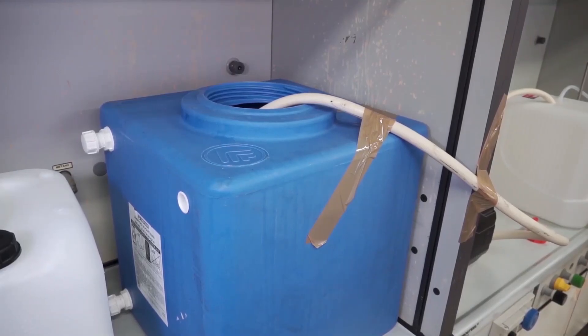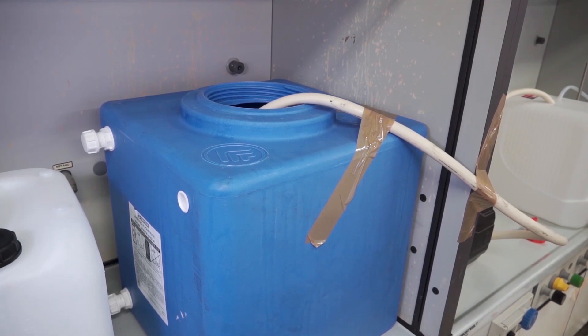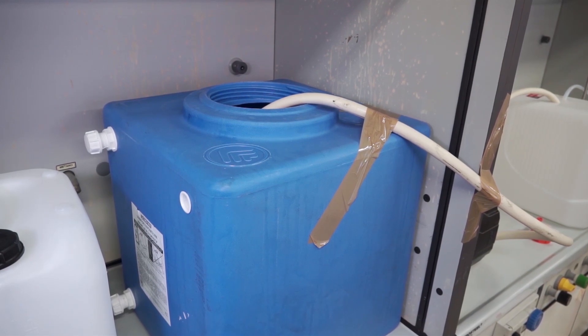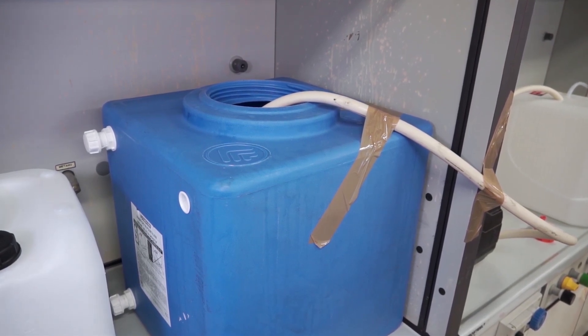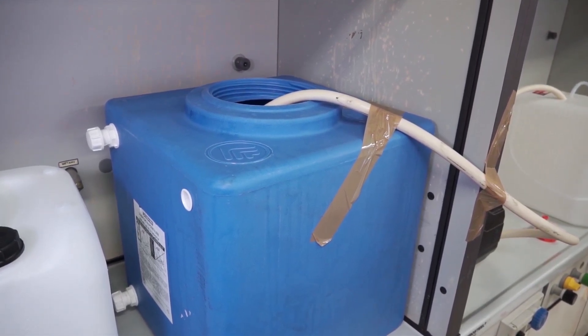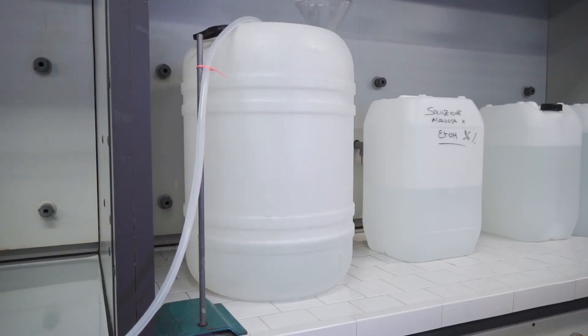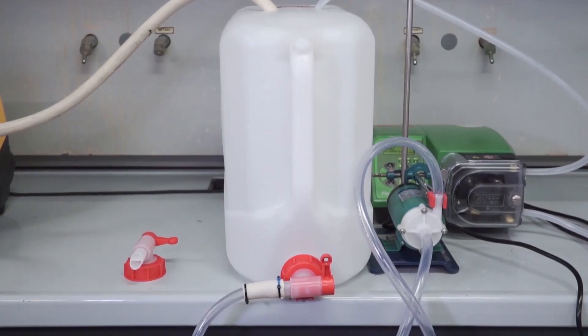Specifically, in the case the productivity is equal to 726 liters per hour, it is recommended to use a tank for the alcoholic solution of at least 100 liters, which has to be placed away from power sockets or sparks, for the aqueous solution of at least 50 liters, and a mixing tank of at least 30 liters.